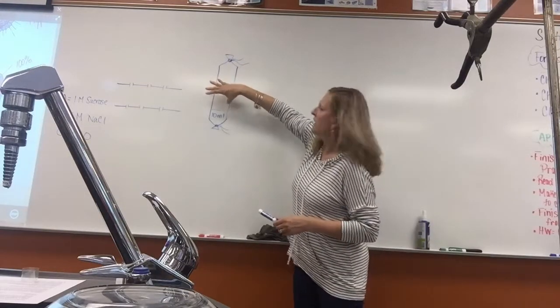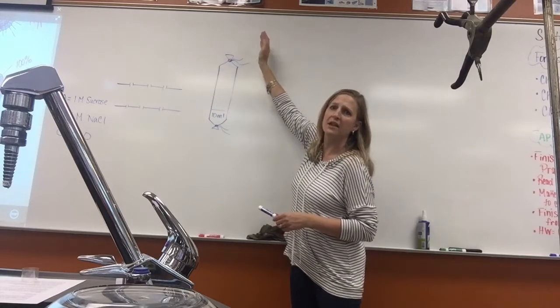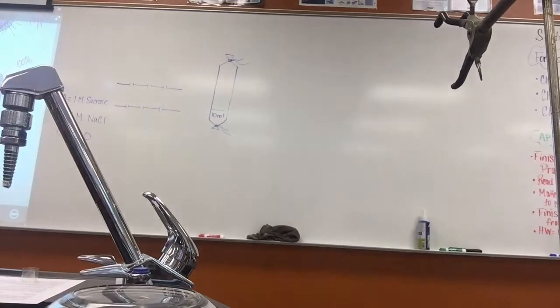Because every year I have kids that want to tie it right here and make a little cell and have all this hanging off. But I want you to do it at the end. Go ahead, Alexis. Oh, but the water will like absorb into the dialysis tubing.